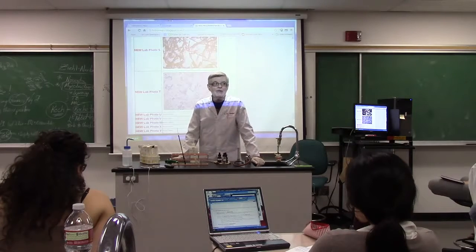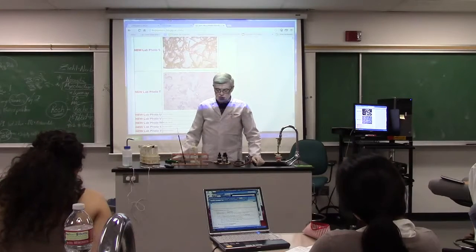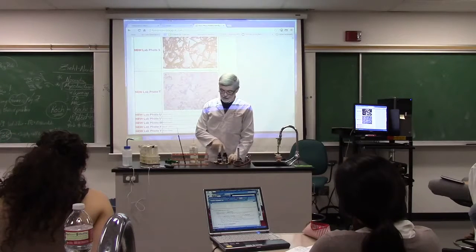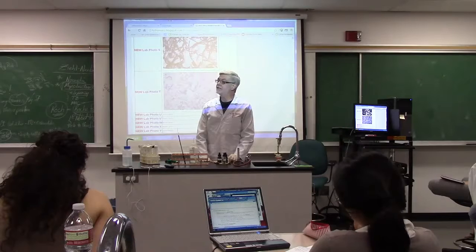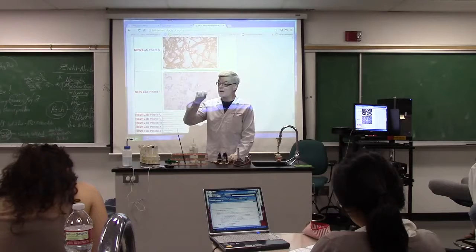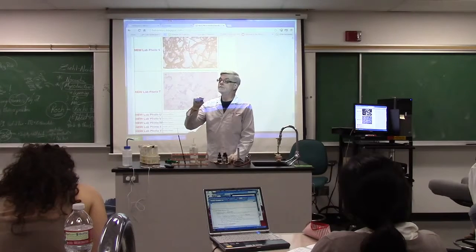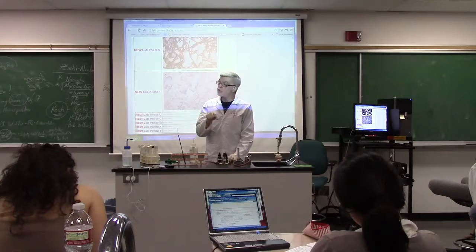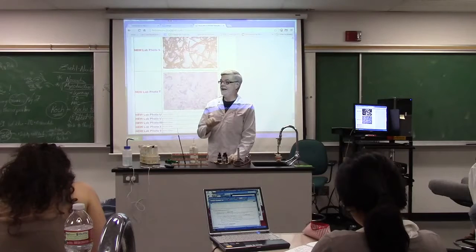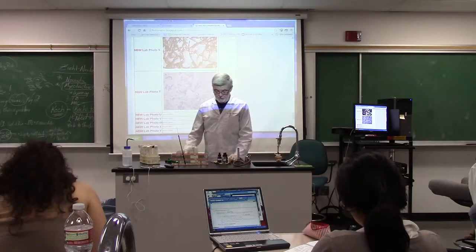So what happens if you get red and blue together? It's purple. So if you didn't get all the carbolfuchsin off with your acid alcohol and you put methylene blue on top, everything's going to be purple, which isn't a color in this stain. It's hot pink and blue. So if you get purple, you either heated the carbolfuchsin too hot and it bound to the slide, or you didn't get it off. You put a drop or 2 of acid alcohol instead of a half a dropper full of acid alcohol. And you're going to leave that on 2 minutes.